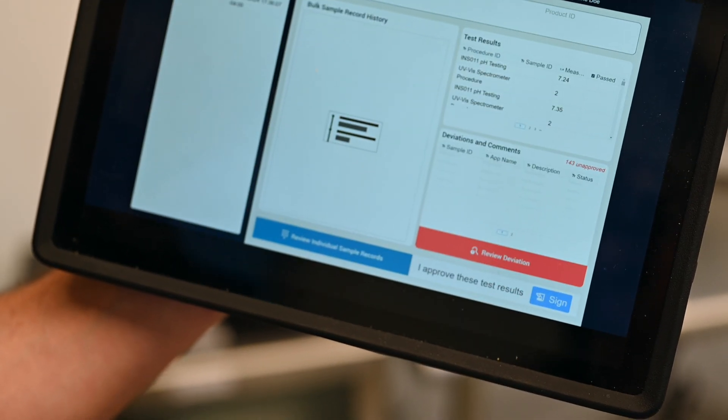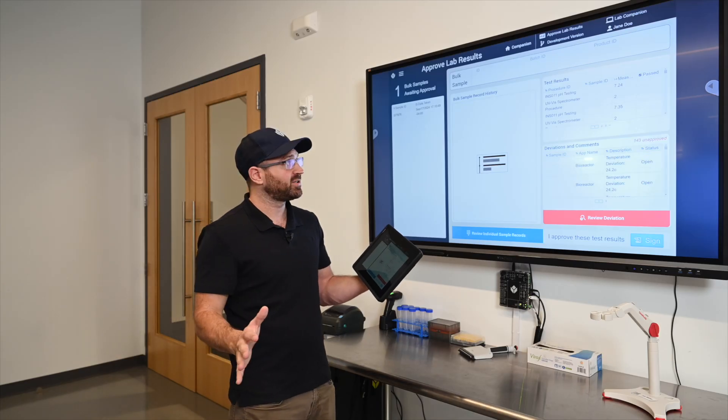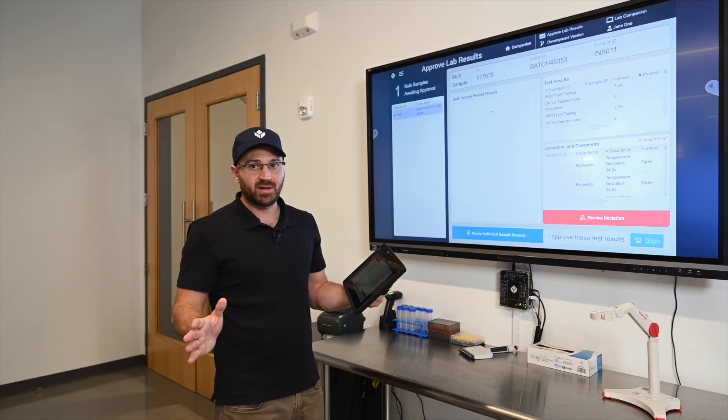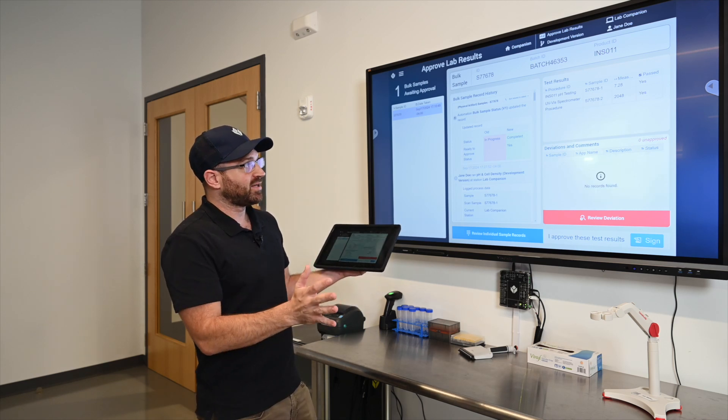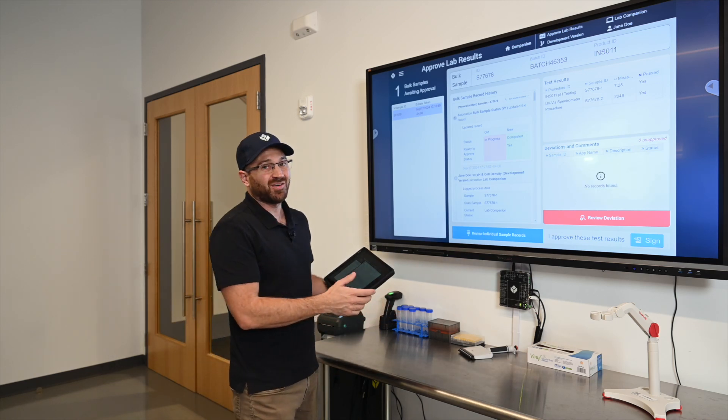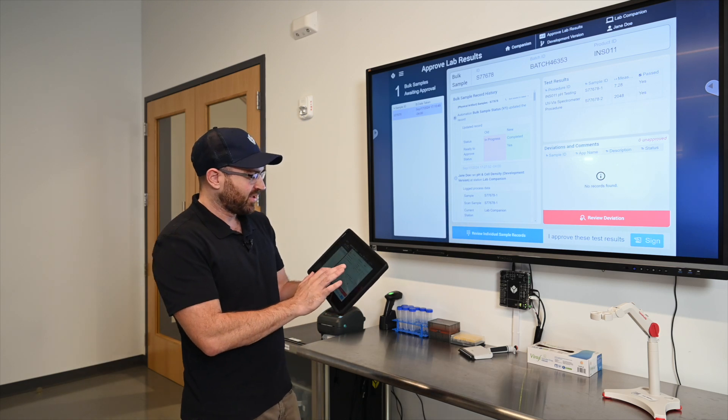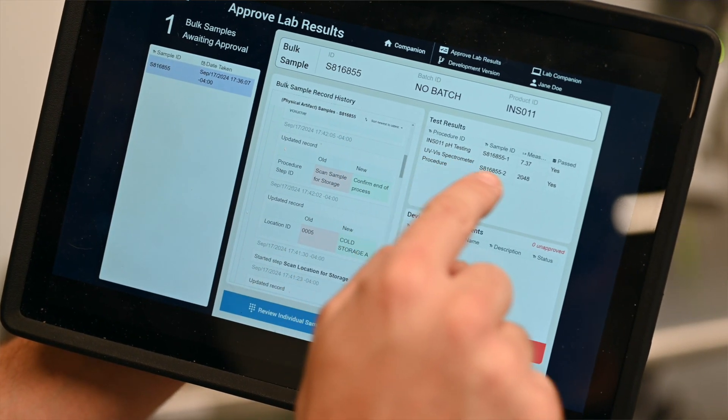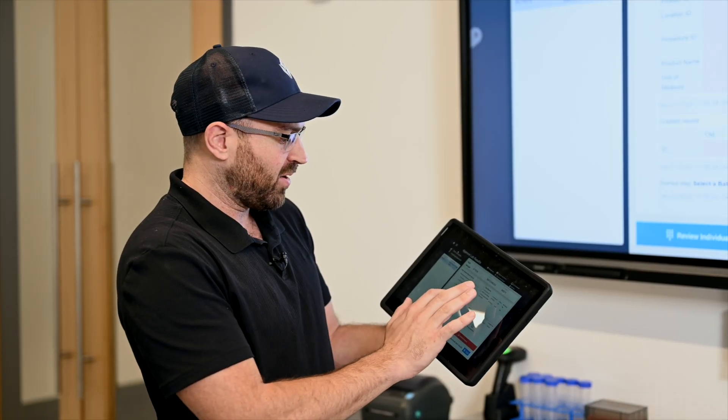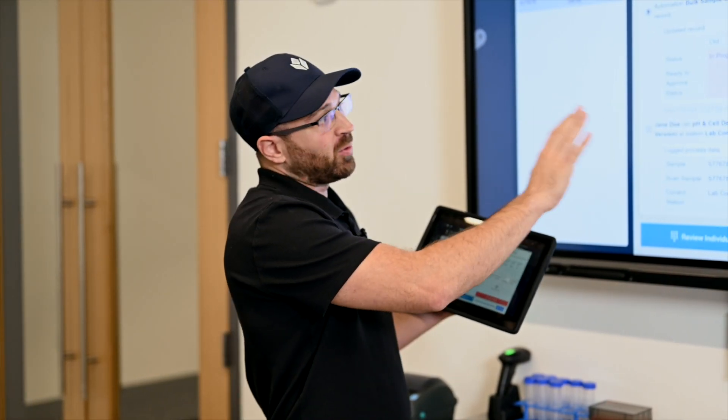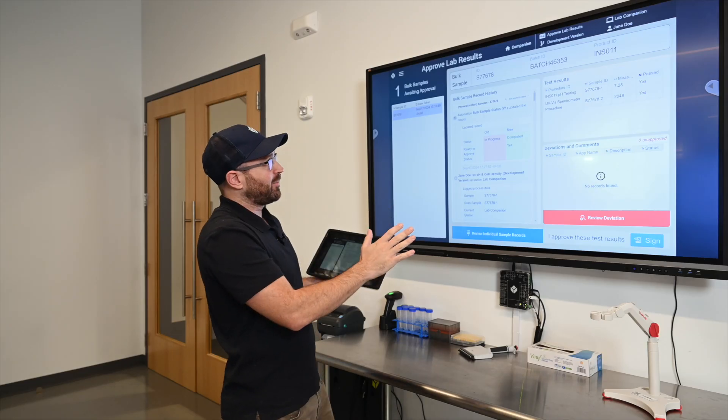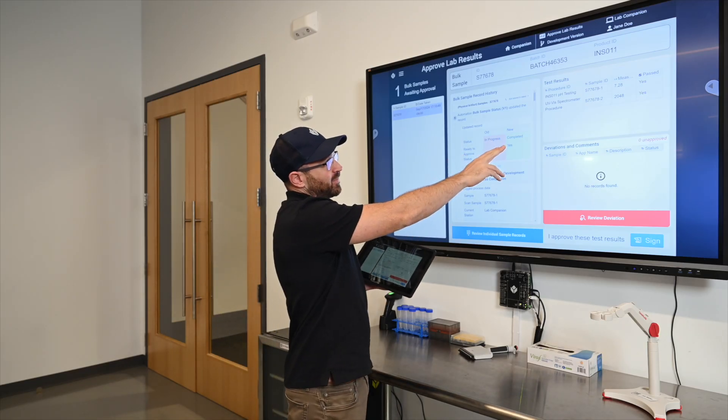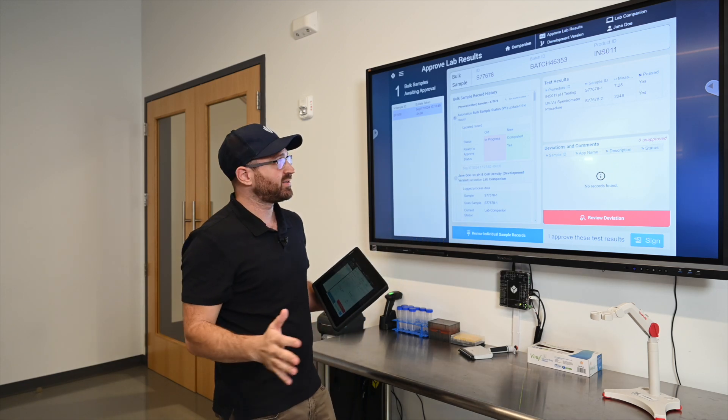So I can look at this and begin to approve those results. I'm going to click the approve results which jumps into another application and maybe only certain people are allowed to use this application. In this application I can see essentially a batch review or a sample review of all the tests that occurred for this bulk sample. So I can review every step that happened with this bulk, even who took it out and when of the bioreactor, as well as what we want to display on the screen here.